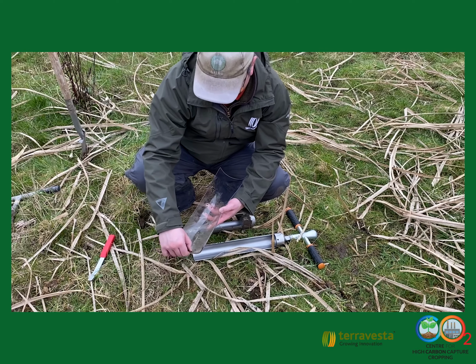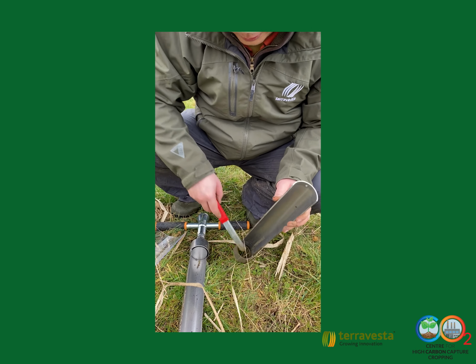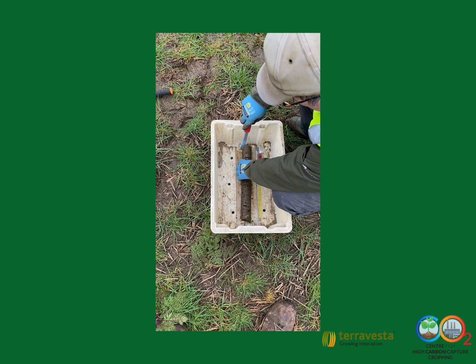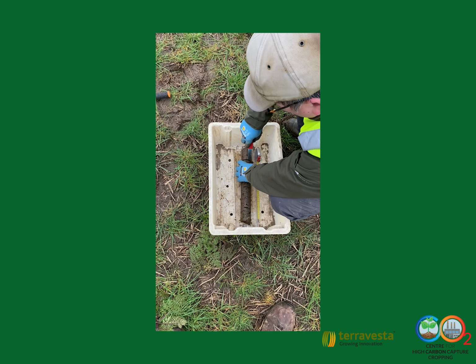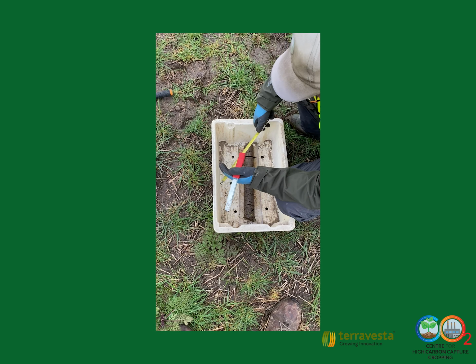After each core has been taken, it's essential to clean the equipment to avoid contamination between samples and different plots. To note, if trimming is difficult due to stones or roots, and it results in a depression within the sample, discard the sample and take another. Do not try to add extra soil to compensate for the depression.